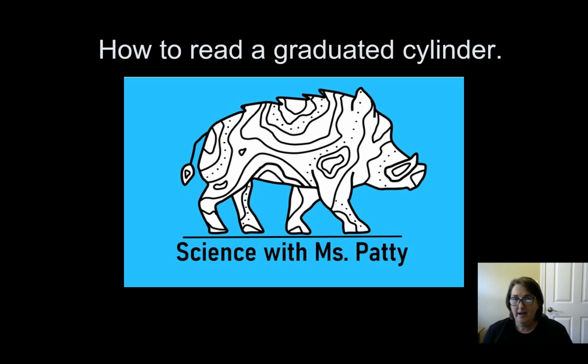All right, that's all I have today on how to read a graduated cylinder.